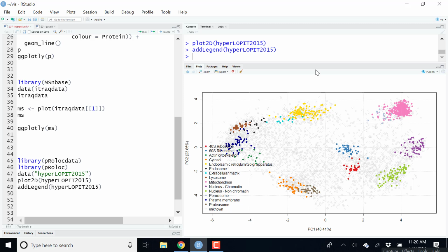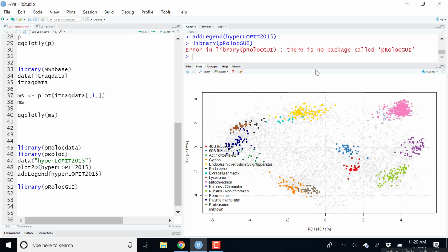And so it's possible, let me check if the packages are installed. They are not installed, and I'm not going to install them now. But it would be possible to fire up an interactive visualization of these data here if I have my data locally and if I have the set of packages installed.